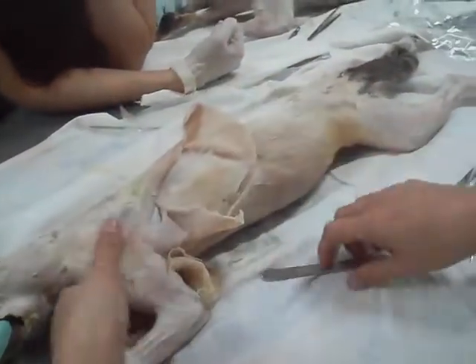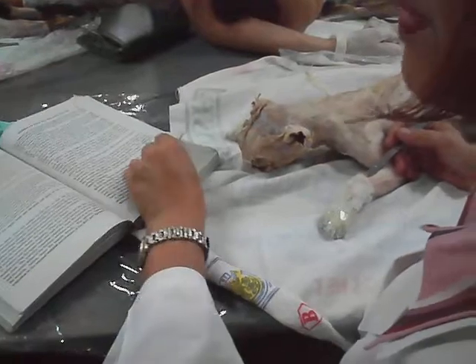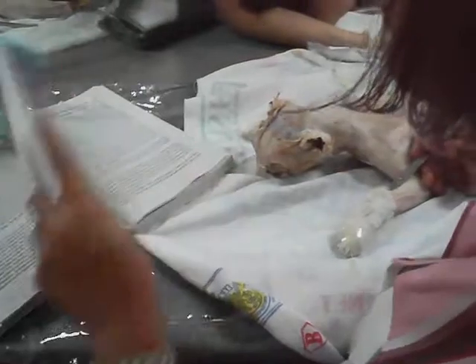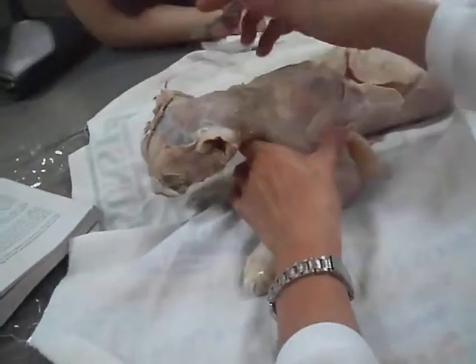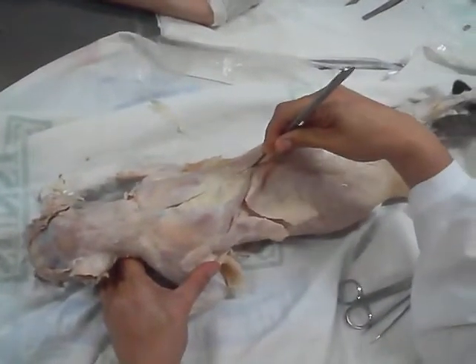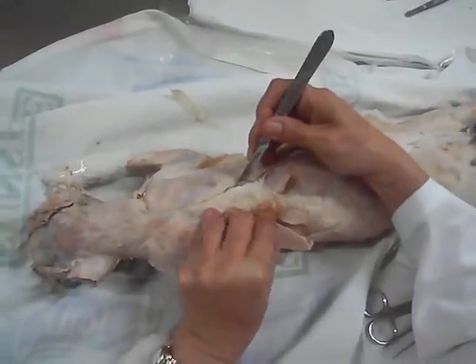And then this is now followed by the latissimus dorsi. So you will know how to go about the latissimus dorsi — you may now cut at the middle. This is pointed towards the other side, and then flop it up.